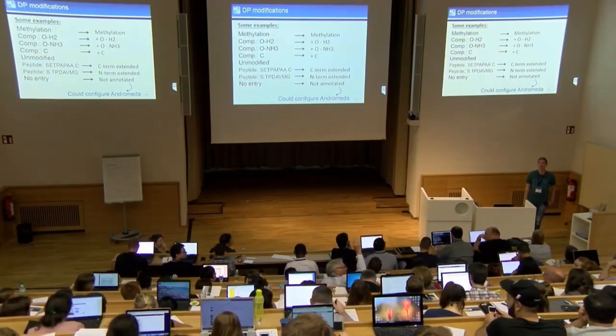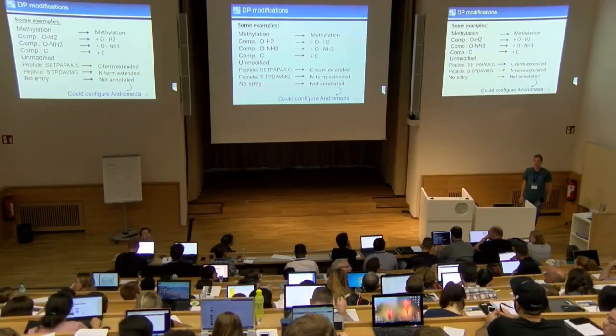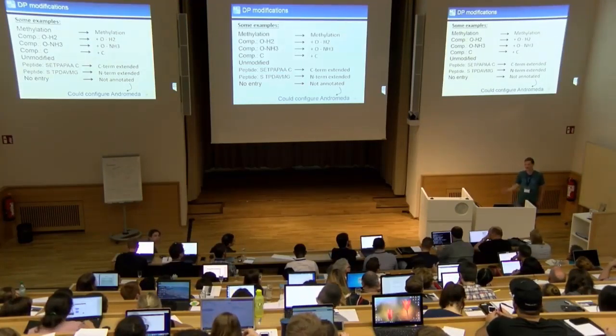Thanks for the interesting talk. My question may sound naive, but when you're making these decoy peptides, is there any chance that this actually will be a peptide that's found in proteins, because you're reversing it and adding the arginine? I guess by chance this could happen, but it's really unlikely.